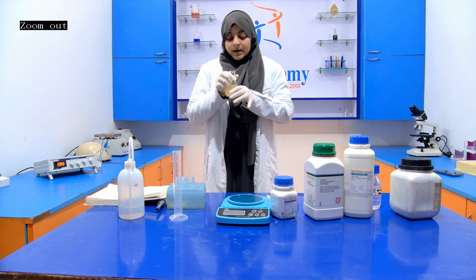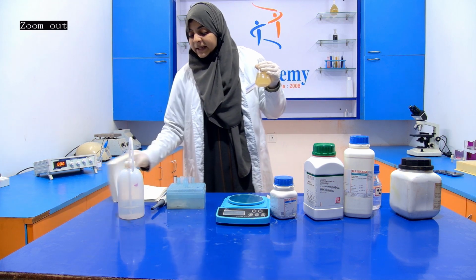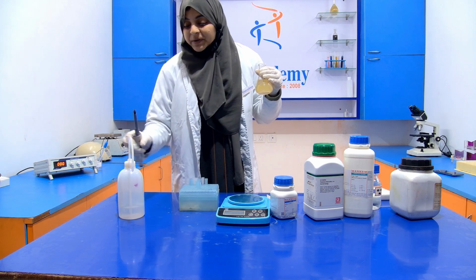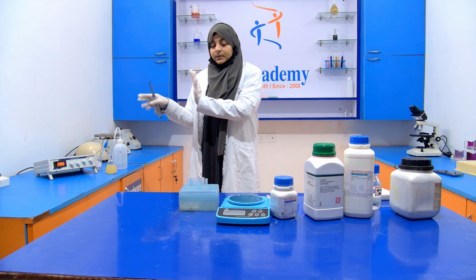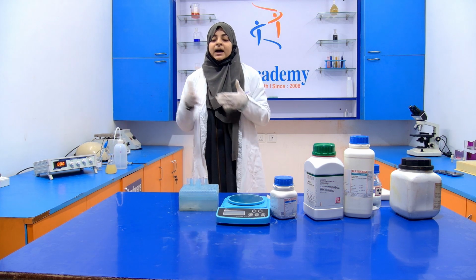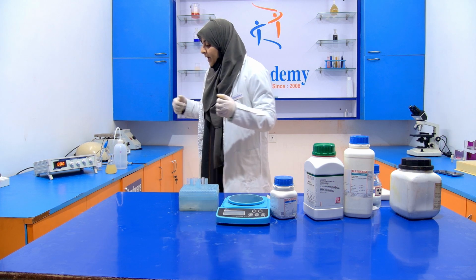So now I am going to maintain its pH, and you know that when you are maintaining the pH, you have to calibrate your pH meter. So our pH meter is already calibrated. As you see, it is already calibrated, and how we calibrate our pH meter, the video related to this is already uploaded in our account. You can go and check it.